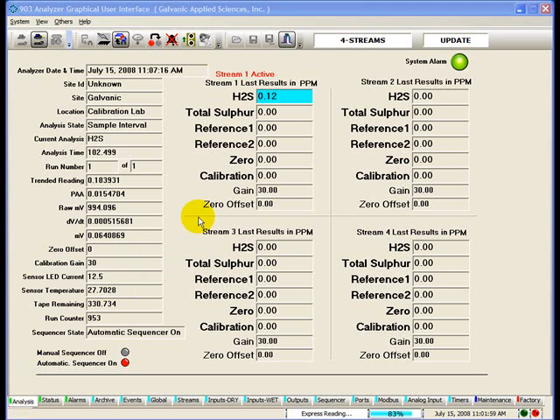The analysis window is designed for a quick glance into the current status of the analyzer. It employs automatic polling every 3 seconds and keeps data refreshed at all times. For that reason, configuration cannot be saved while in the analysis window. All command buttons are grayed out in this mode.